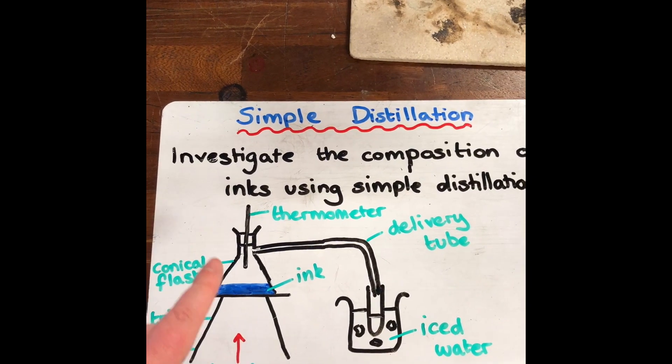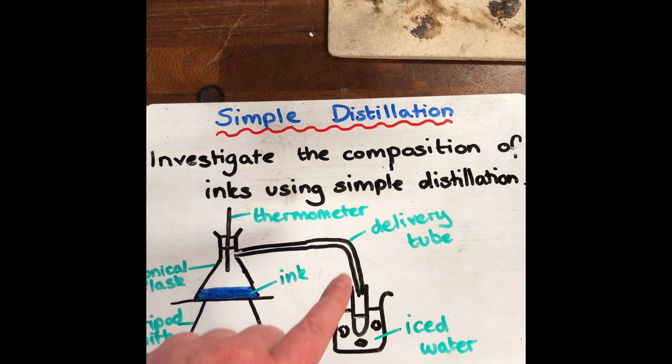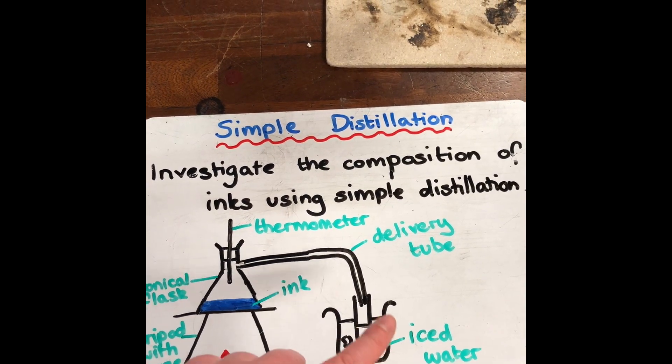What then happens is when the water boils from here, it then passes through the delivery tube and it condenses in the iced water. And that's why the water needs to be iced.